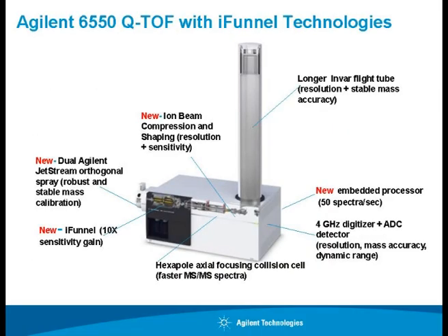So typically, in a quadrupole time of flight instrument, you have a quadrupole and then a time of flight, where the ions will travel like this and the time is measured, coupled with a collision cell where you trigger an MS-MS. What is the word we typically use? LC-MS-MS. Okay, so there is an LC component, a liquid chromatography component, also coupled to an MS.